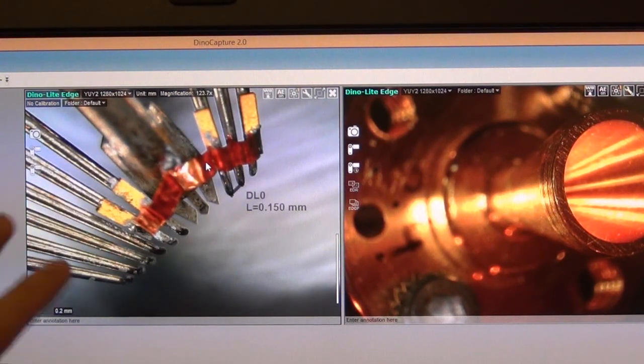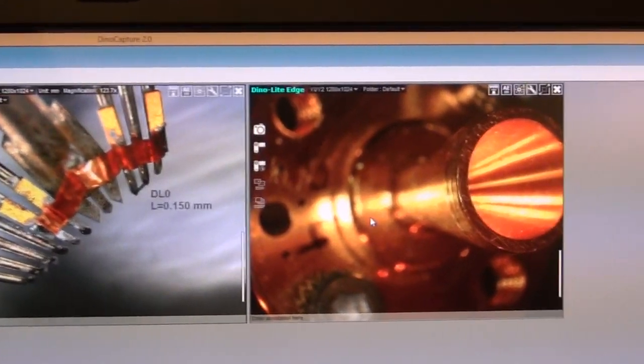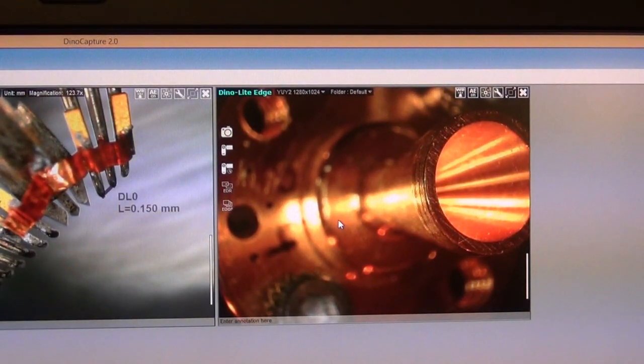Now this is annoying. Why is it annoying? Because I cannot have this in focus at the same time as the needles. And the reason for that is, of course, because depth of field is a function of distance to the subject. That's an optical limitation. It has nothing to do with these microscopes. So on the right side, the 4815 model has this ability that allows you to capture multiple images, and the software will automatically reassemble them together and give you an image that has a much higher extended dynamic range, extended depth of field.